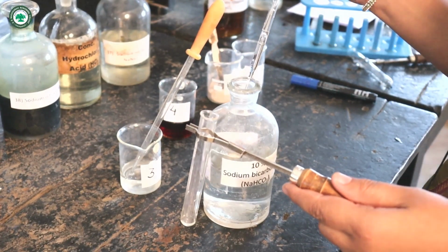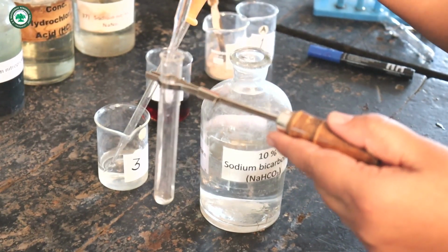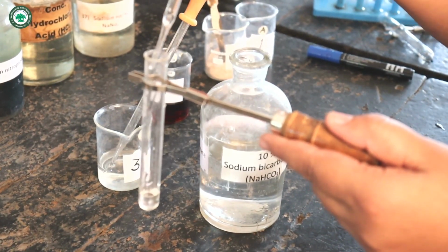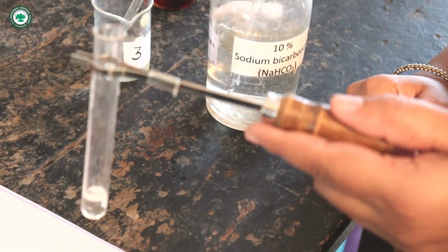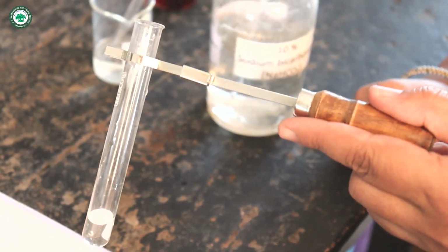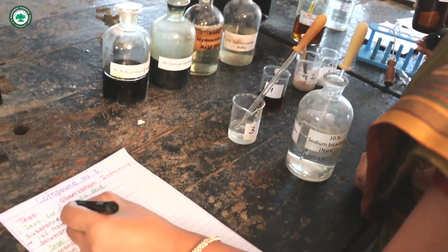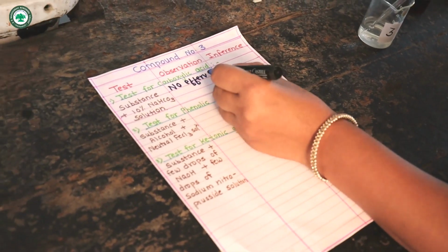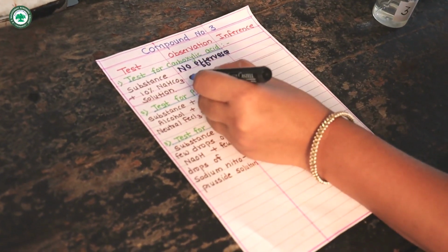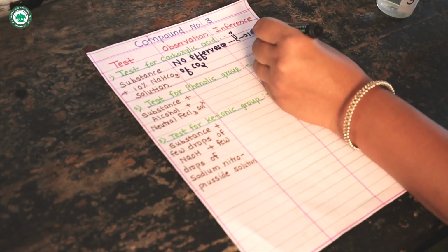If there is brisk effervescence of CO2, then carboxylic group is present. No brisk effervescence of CO2, therefore carboxylic acid group is absent. Now write observation. No effervescence of CO2. Carboxylic acid group is absent.